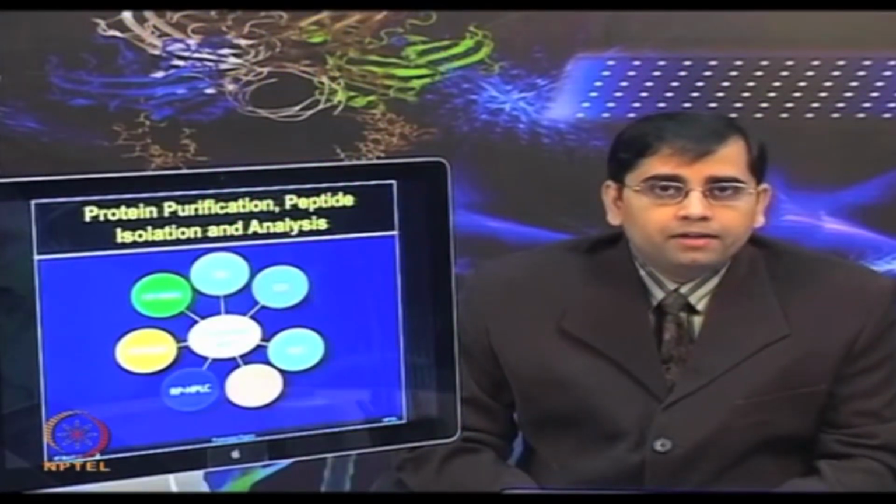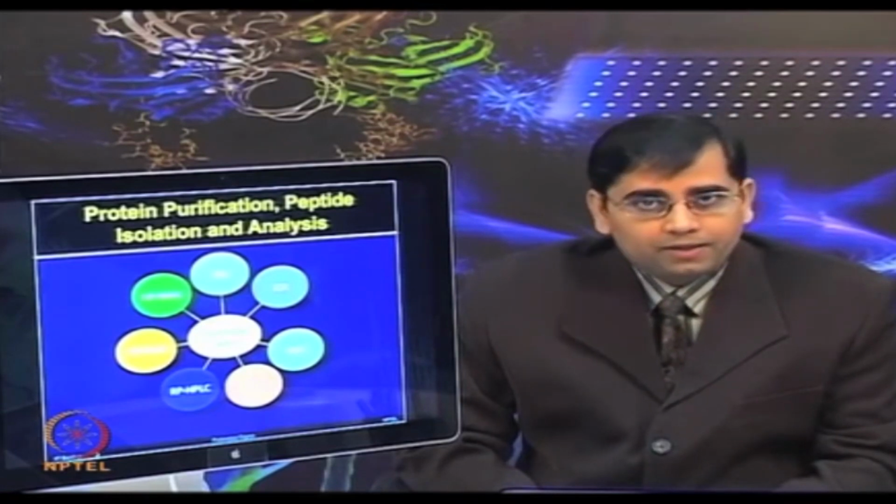These are only few chromatography methods, but there are many more which are also used for different type of applications.